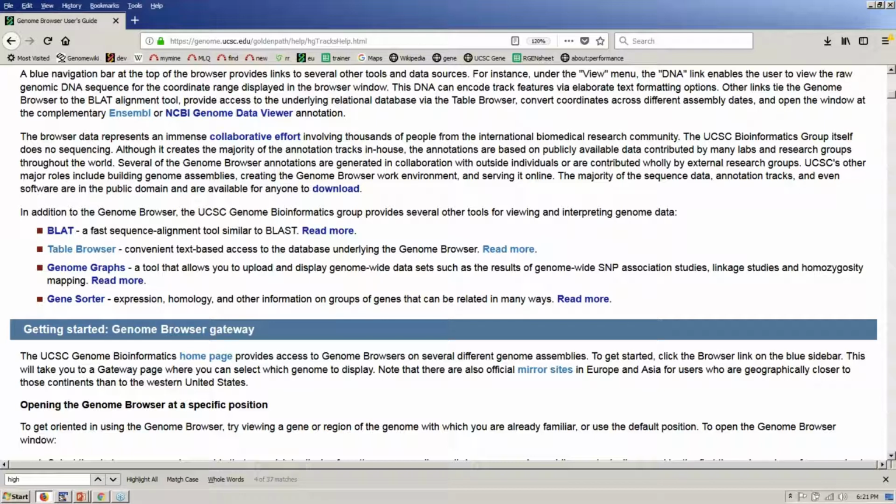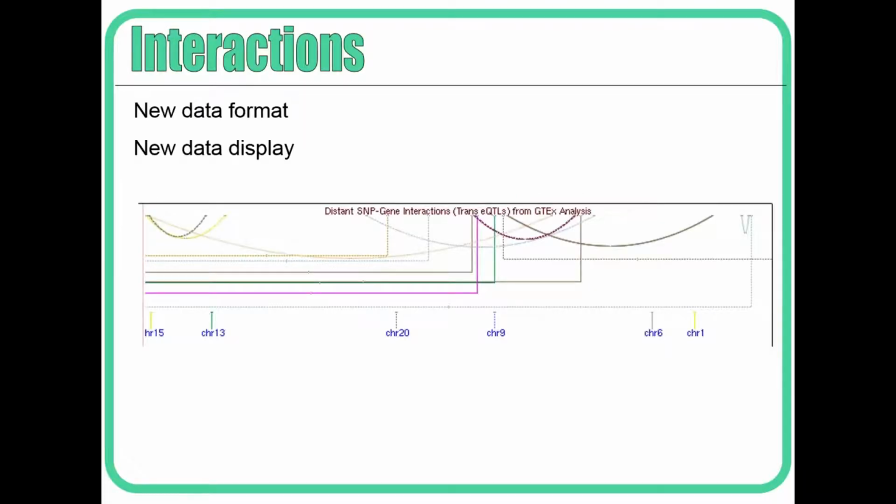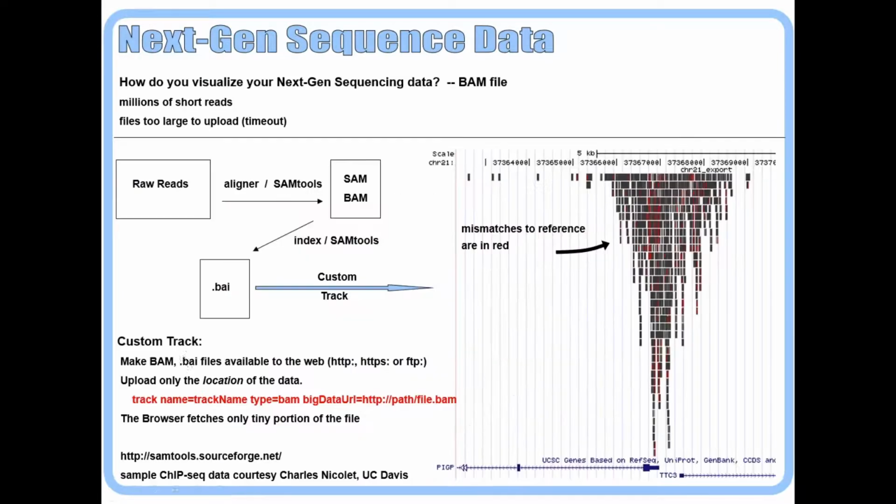Typically about 100 megabytes will be the limit. And I did describe in passing earlier that the BAM file has to be loaded via a URL on our server. So if you put your BAM file in a server location where it's accessible via HTTP, then you load it into the browser via the HTTP link. There it is in red on my slide here.